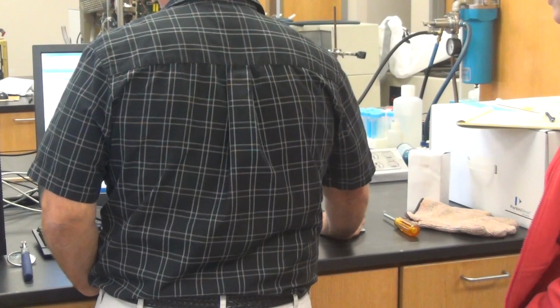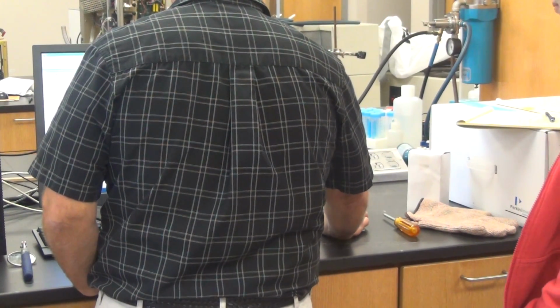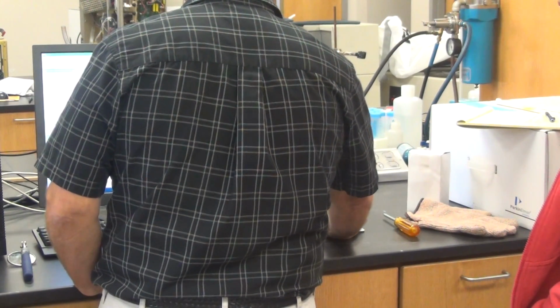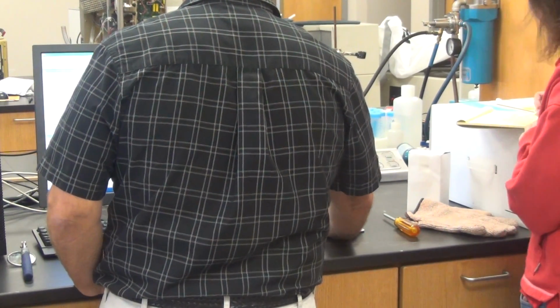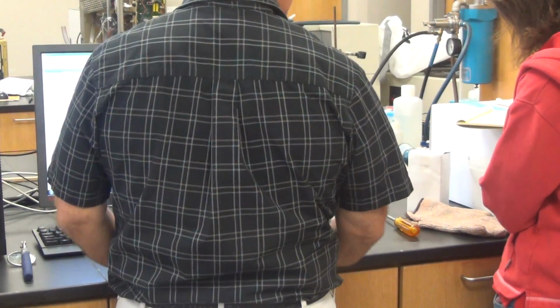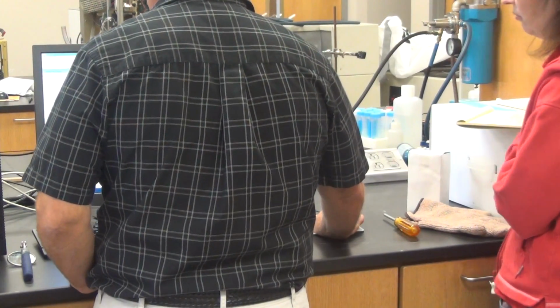So I'm going to go open, and go back to where your methods will be. So I'm going to go to data, methods. So now your pointers are in the right spot. It always knows wherever you last opened.